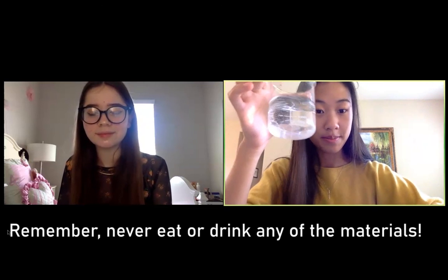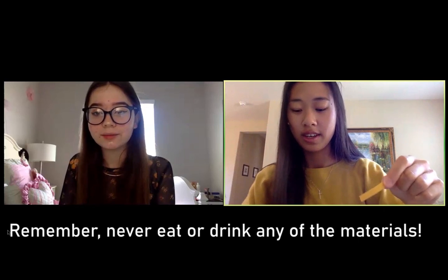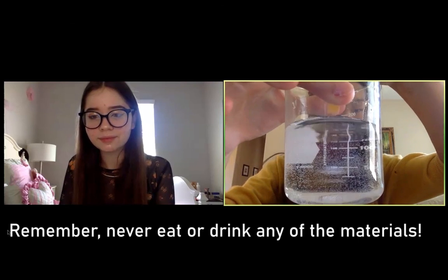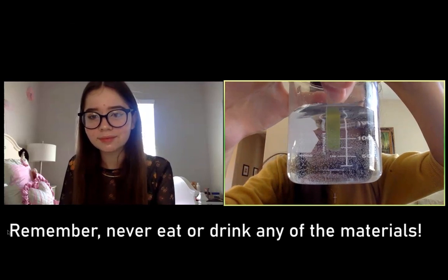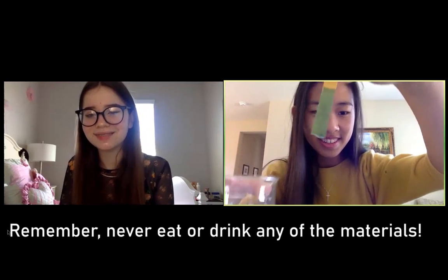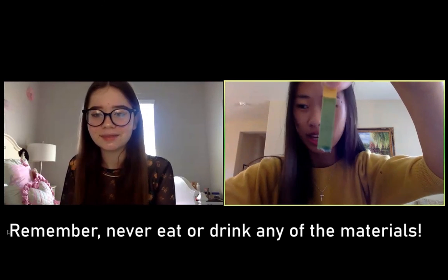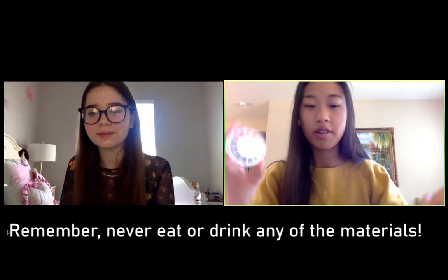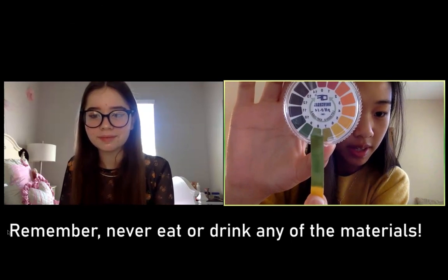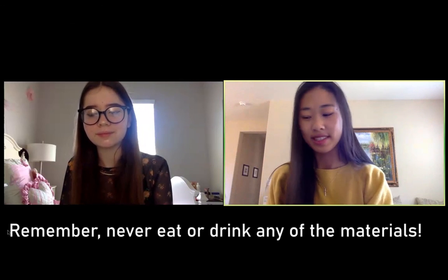And so this is a base, and we're going to take another pH strip and put it in. Whoa! See, it turned from the yellow to a blue-green. And then going back to the pH scale, it looks like it's around a pH of 8 or 9, which, as we learned, is basic.